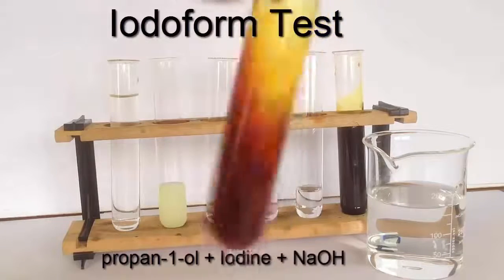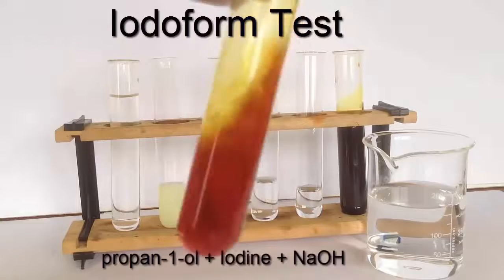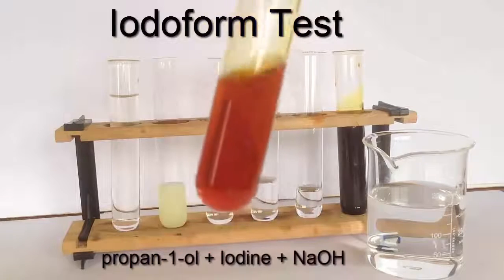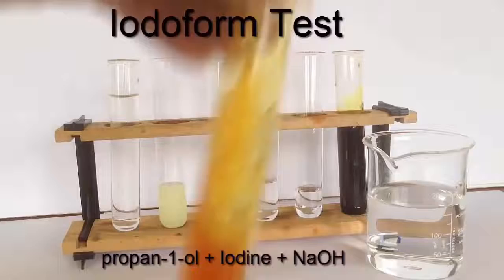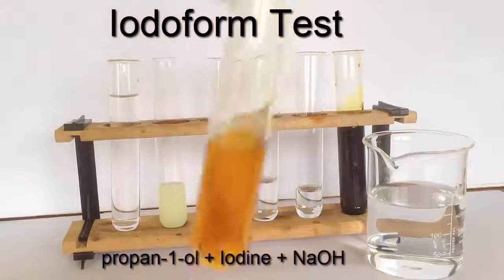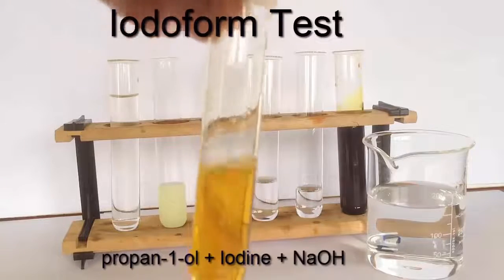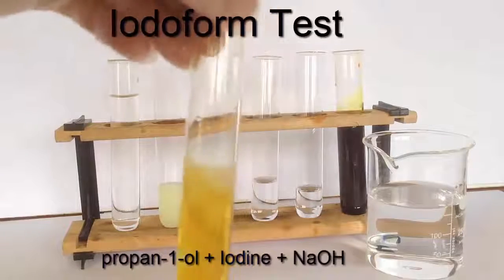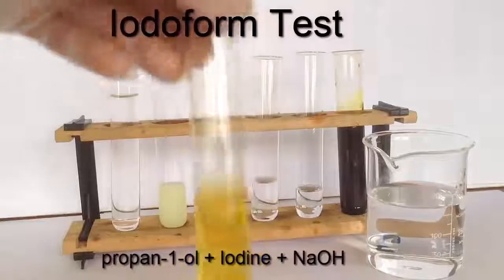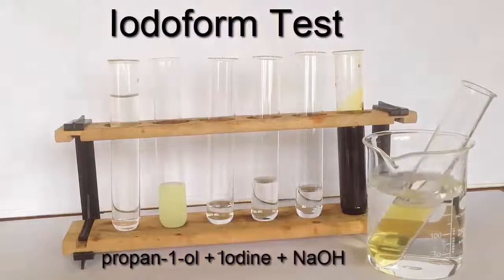Again, I keep adding it with shaking until the brown color just disappears, and we're looking for one of two possible outcomes. It's either going to fade and fade and eventually form a colorless clear solution like water, or it's going to jump over to a yellow color and become cloudy as a yellow precipitate forms inside, and that precipitate will have an antiseptic smell.